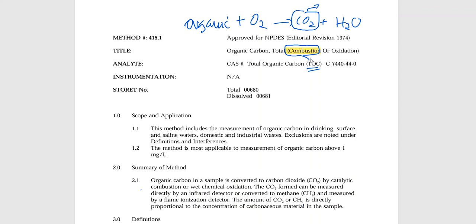All right, so it's going to be an NDIR, and that detector is called a non-dispersive infrared detector. So it's going to be looking for CO2 as it gets generated. As that comes through the machine, it's got one job only. Don't screw it up, because that one job is what you have been designed to do. You've got no other responsibilities other than watch for CO2. So that is, in a nutshell, what's happening here with the machine as we use them.